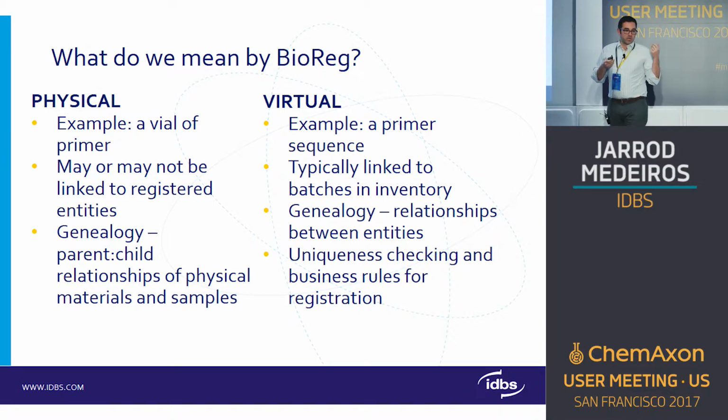within. So if I bring in a cell line from an external vendor, and then I use that cell line to express a number of different supernatants, and then I take those supernatants and put them through some different processes, there's a whole relational aspect along the lines of those entities as they've gone through that at the physical level that may not actually be tied to the virtual level. By the same token, at the virtual level, if I create a plasmid that has a certain insert for DNA that encodes for a specific protein, there are relationships along both of those that we're looking to track.